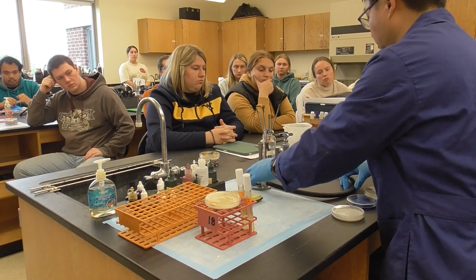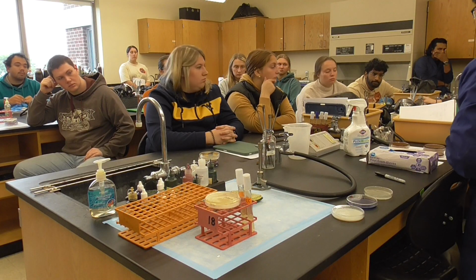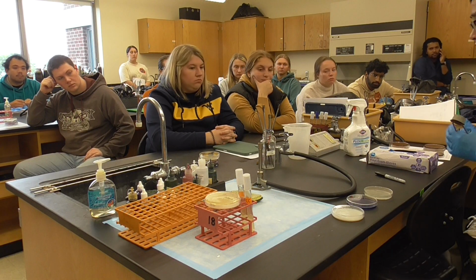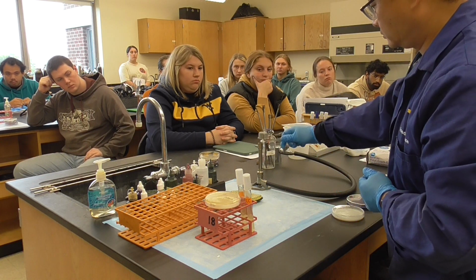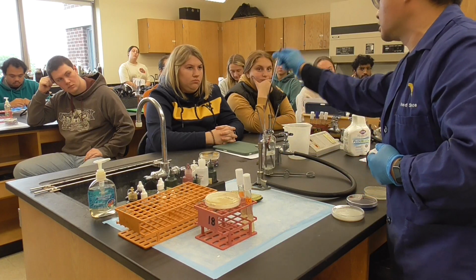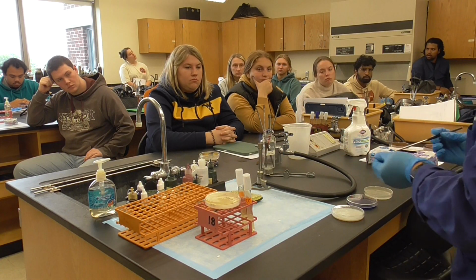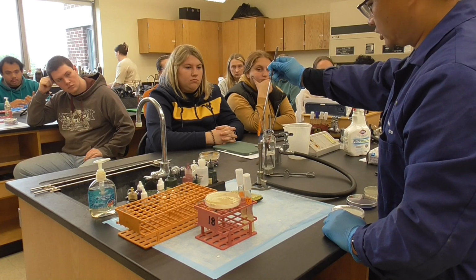Now what you do is use your Bunsen burner. I'm going to turn it on. We're going to go back to using the loop. Make sure it is sterilized.